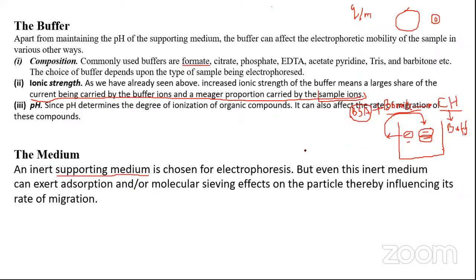This is a supporting medium. It is not actually going to cause a very substantial change during electrophoresis, but it enhances the extent of resolution that you're going to get. That's the purpose of electrophoresis: you should get essentially good separation, right? And you can do it by using certain inert support media. Now, although we say inert, there are certain support media that interact with your molecule as well, and that interaction can sometimes be used for your benefit.